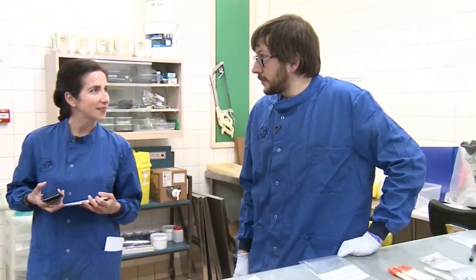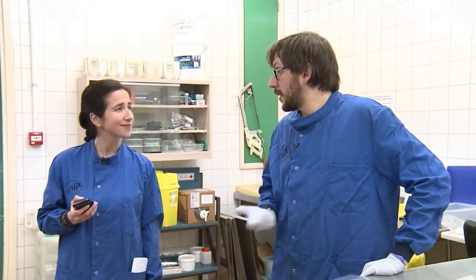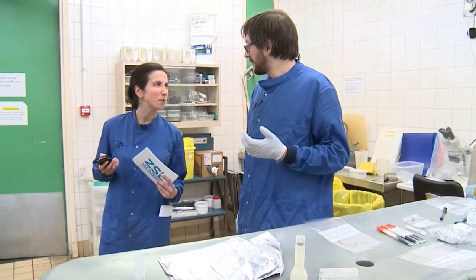So we will take teeth. Okay. Teeth are standard, so you can use the teeth to age the animal. It's very similar to a tree with growth rings. My brain's gone blank. I'm thinking of worms.